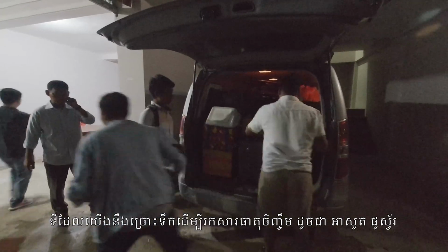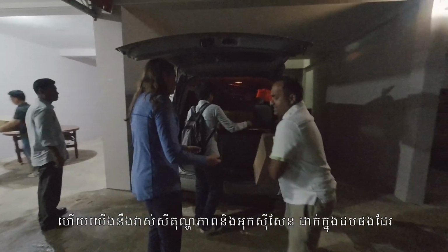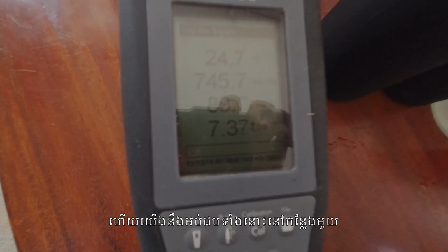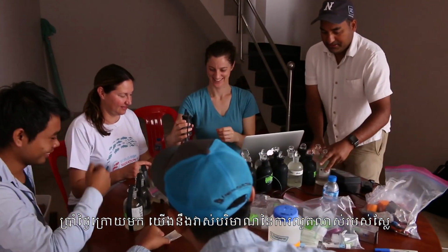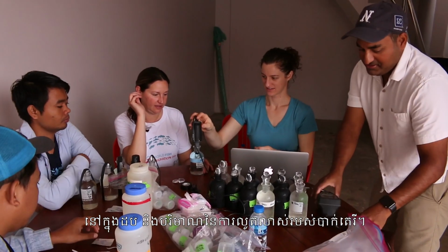So after we collect the water, we are going to take it back to our makeshift hotel laboratory where we will filter the water for nutrients of nitrogen and phosphorus, and we'll also measure temperature and oxygen within bottles. And we'll incubate those bottles or place them in light and in dark settings for the next day to 5 days, and we'll measure the amount of algae growth in the bottles and the amount of bacterial growth within the bottles.